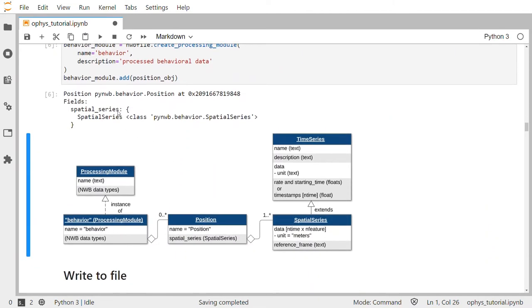This prints out the contents of the behavioral module, which consists of a position object and the spatial series object inside. The class diagram here depicts what a processing module is — it's just a container that has a name and can contain any number of NWB data types. Here, we've created one called behavior and linked it to have a position object.